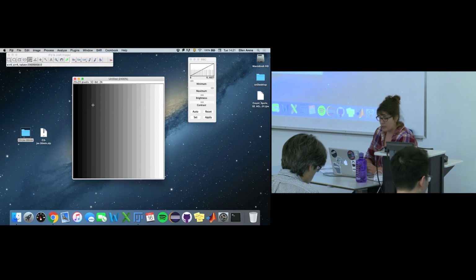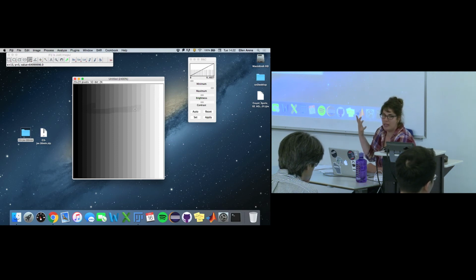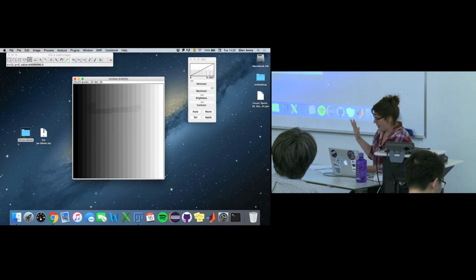So now if we're actually probing the pixels, we can see there's some wonky things going on in our pixel values. Do you see there's some weird results that happened? Yeah, the numbers aren't adding up, right? Because we are increasing the precision in our 32-bit float values, we're multiplying these small numbers by really large numbers, and there's an imprecision there. Computers are discrete. So it's just important to remember that the maths in these cases are not always perfect, which can seem scary, but don't be scared. It's an approximation of space, essentially, right?